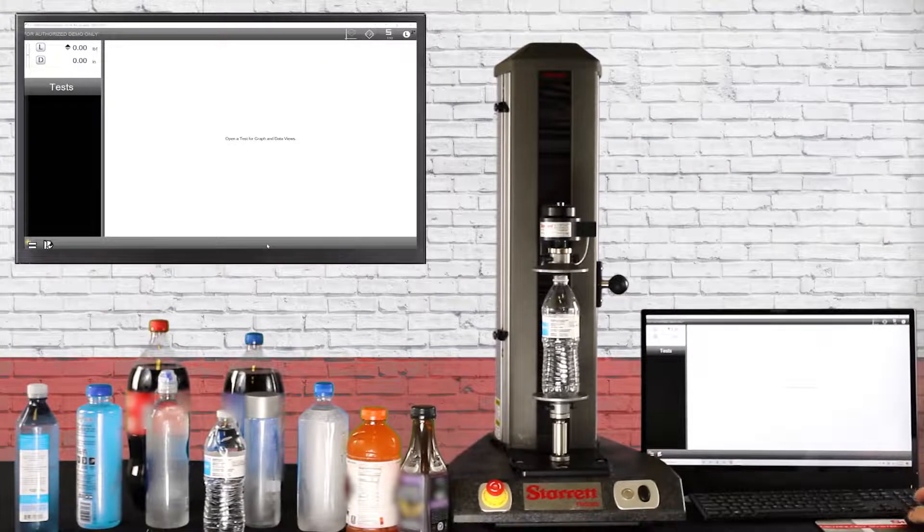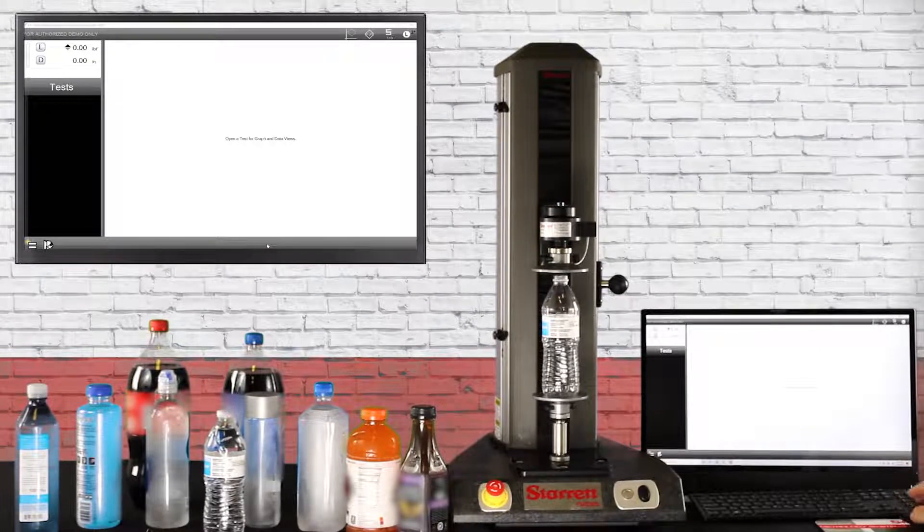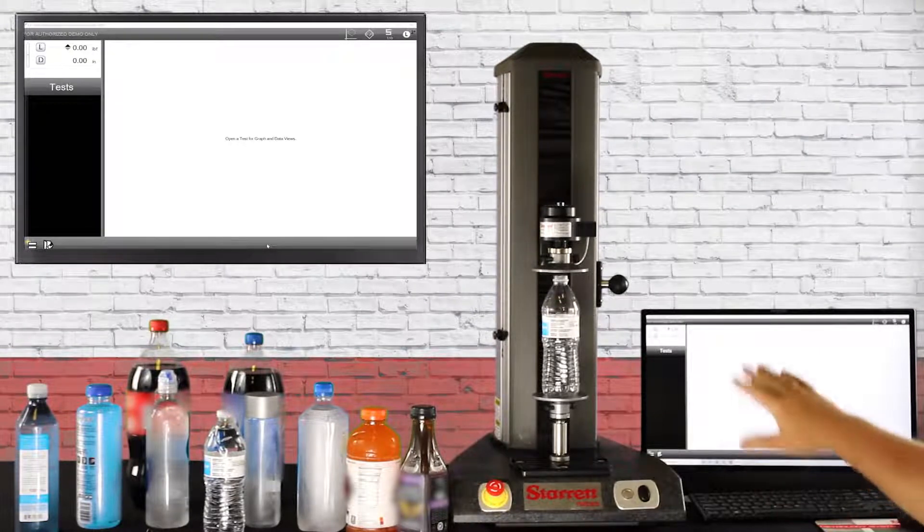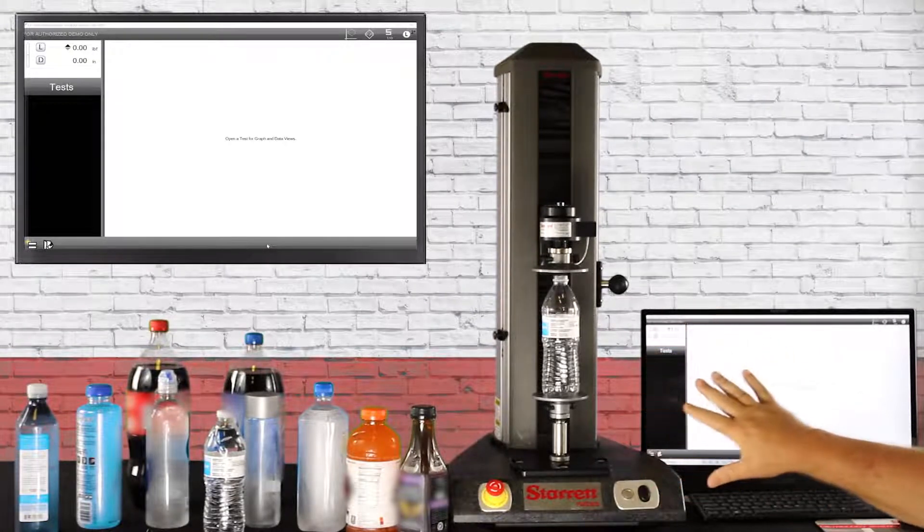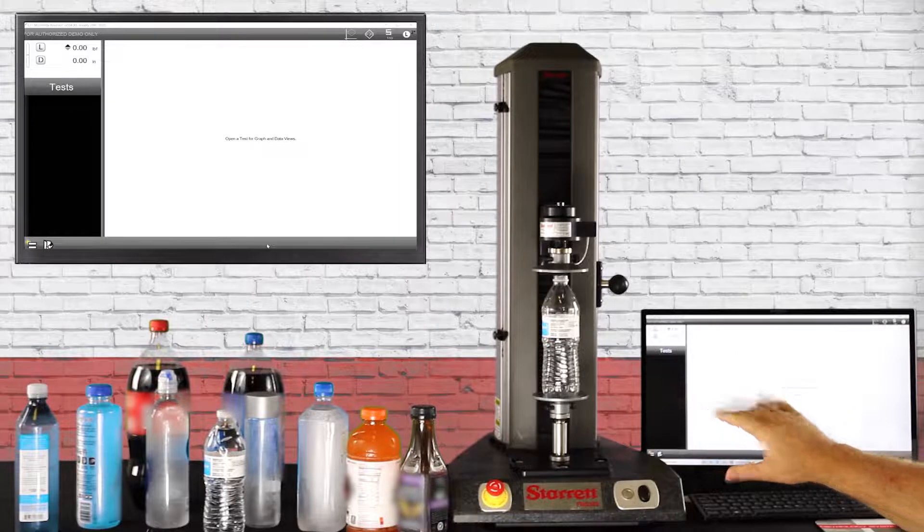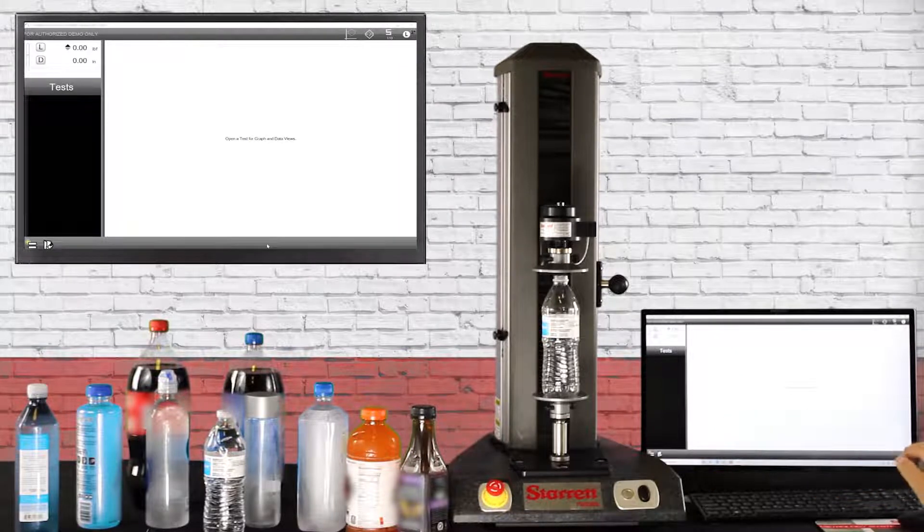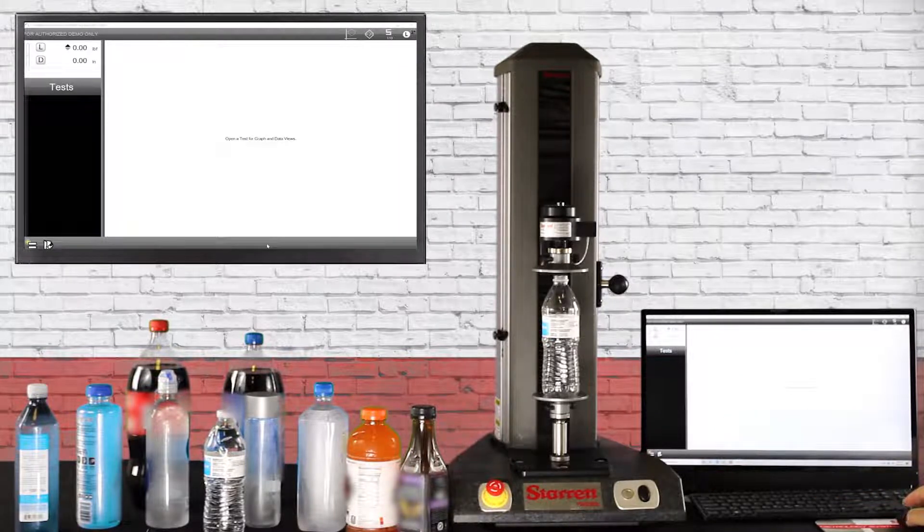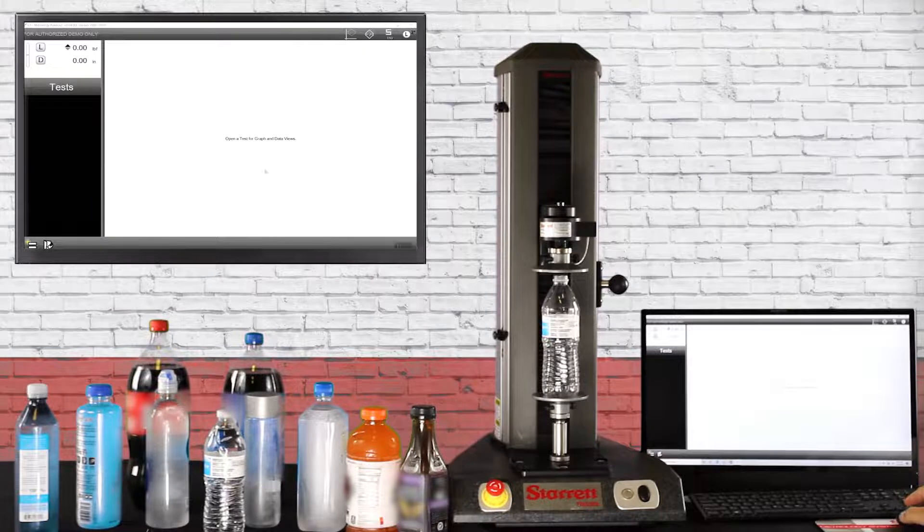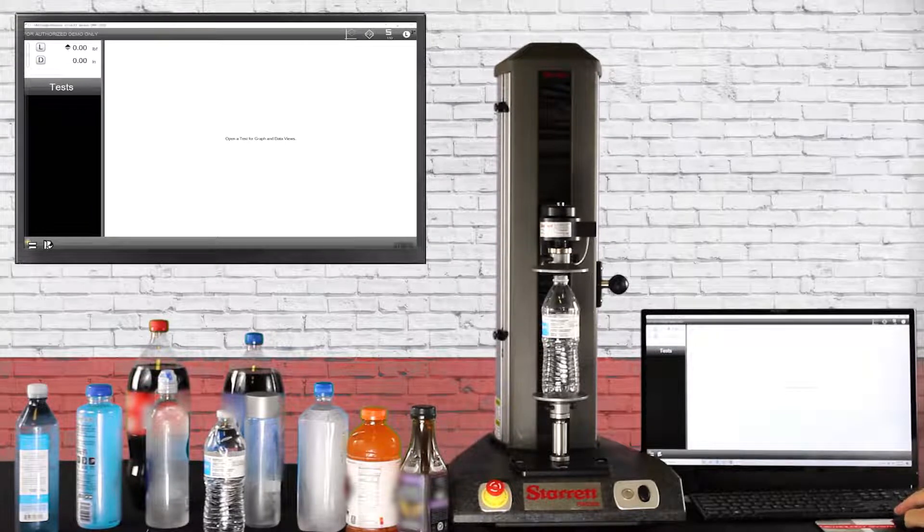Okay welcome back, we're going to make the program now as you can see we've set up everything. I'm going to be off frame for this particular shot so you can see more of the screen and the tester, so let's get started.